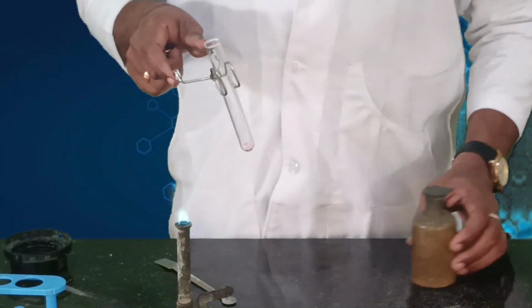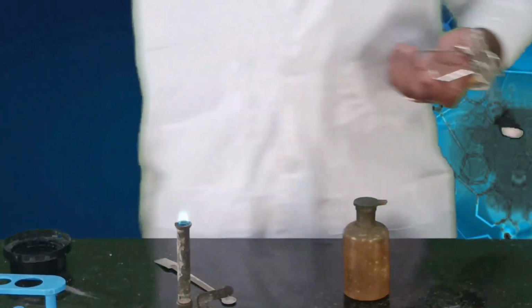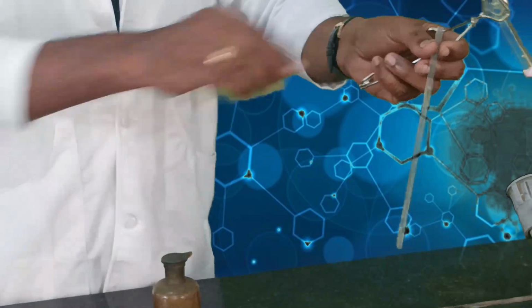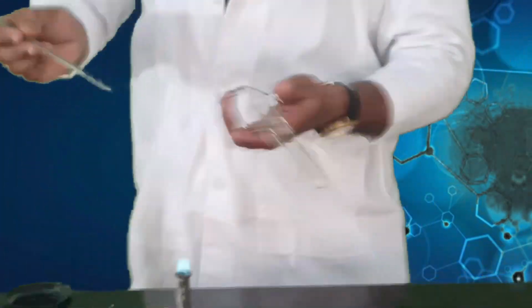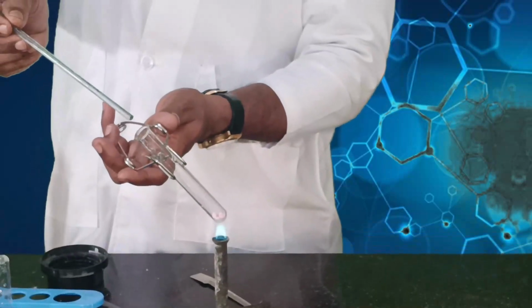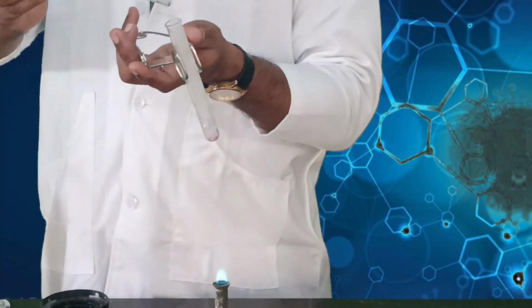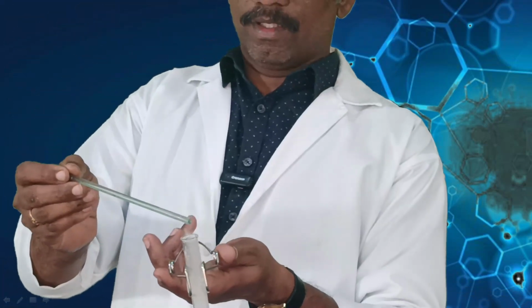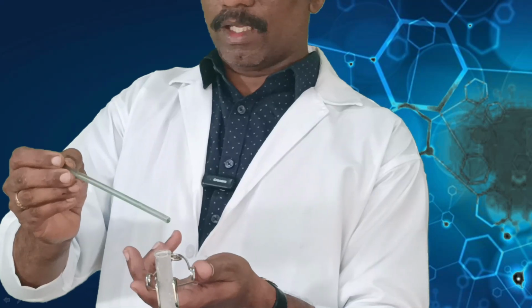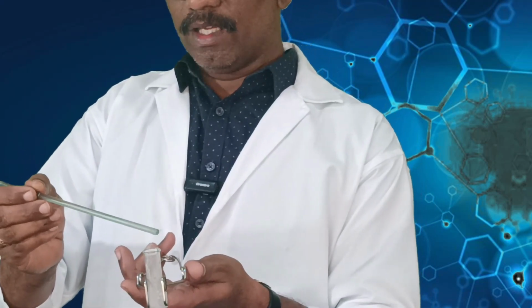When you heat, you will get the smell of ammonia. The smell of ammonia can be detected using a glass rod dipped in concentrated hydrochloric acid. Okay. Now, while heating, place the glass rod dipped in concentrated hydrochloric acid. You will get dense fumes. The formation of these dense white fumes indicates the presence of amide.